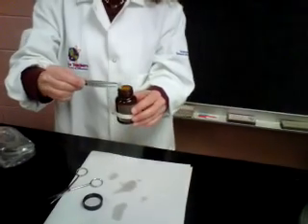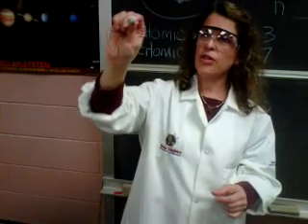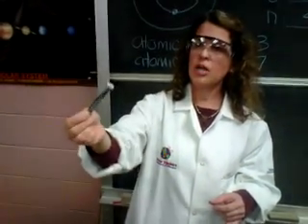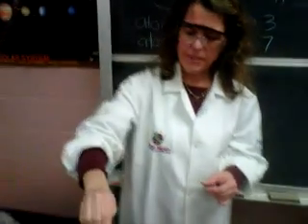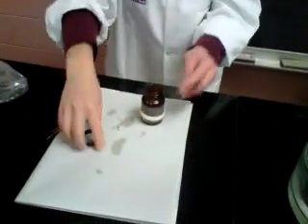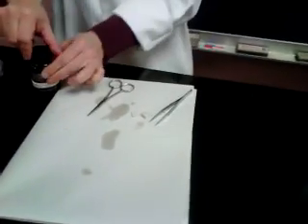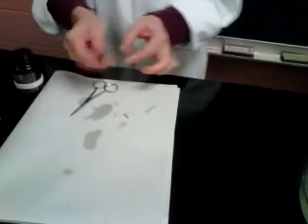This is sodium, also an alkali metal. You'll notice it looks a little different. What does this one look like? Looks like chalk, like a piece of rubber, an eraser. That's because it's tarnishing, it's reacting to the air. It's a highly reactive alkali metal. If I cut it, I'm going to cut it quick. Can you see the edge? Shiny, right? So we're going to put a little bit of sodium in the water now. Maybe I'll change the water.